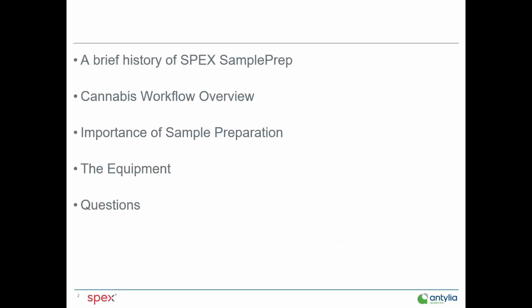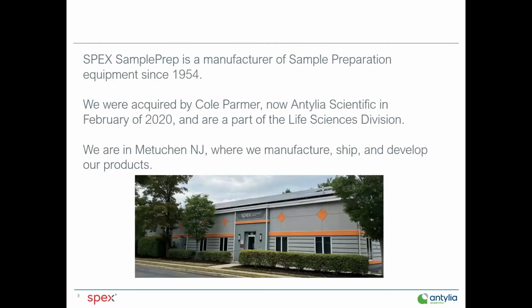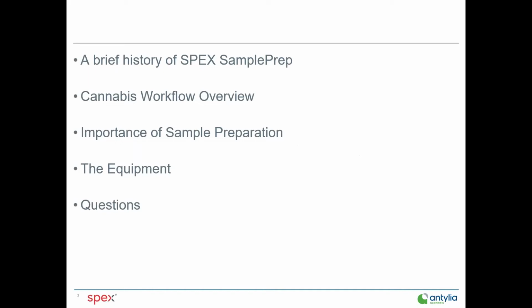Okay, so today we're going to talk about a brief history of the company. We're going to go over a little bit of the cannabis workflow, and then we're going to discuss the importance of sample preparation. We'll go over some of the equipment that can help with these challenges that you'll find, and then we'll have some time for questions afterwards as well.